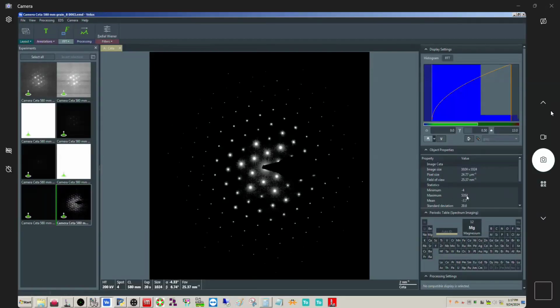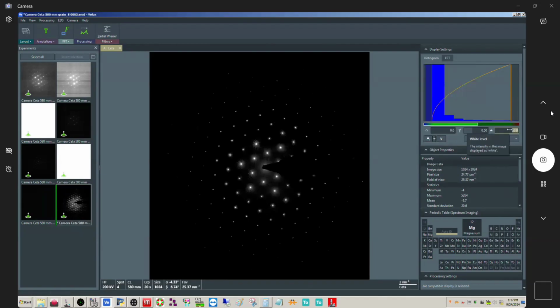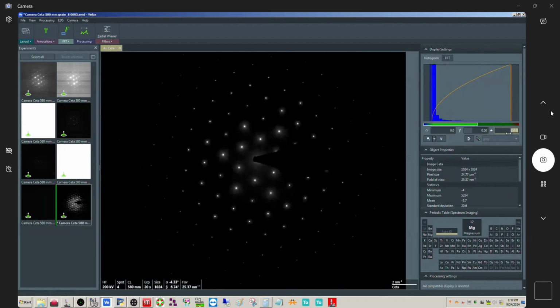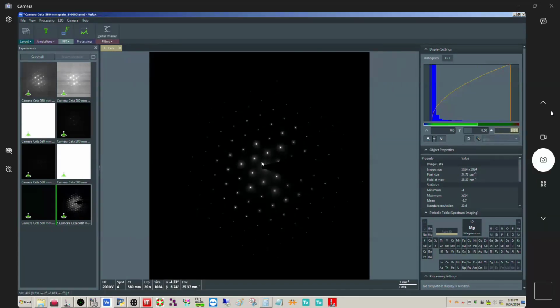Okay. Yep. So we're under our limit here. Let me stop, blank the beam. Okay, this is at 0, so we don't need to worry about that. Yeah, so that looks really good. Again, if you block the direct beam off, the only thing about this is this isn't centered anymore, right? So just aesthetically, it doesn't look quite as nice, but you know, don't let the perfect be the enemy of the good, so they say.